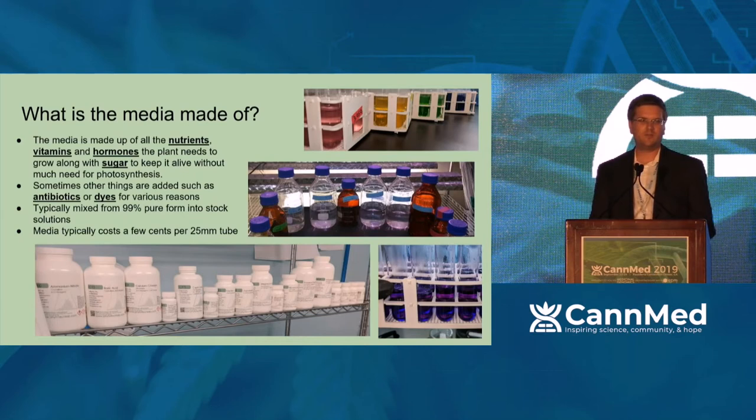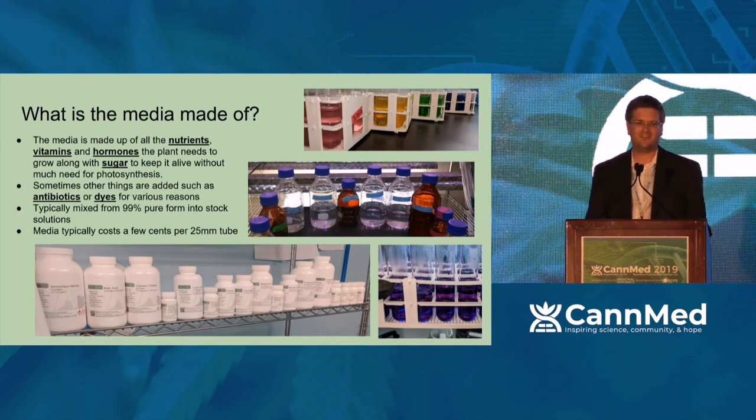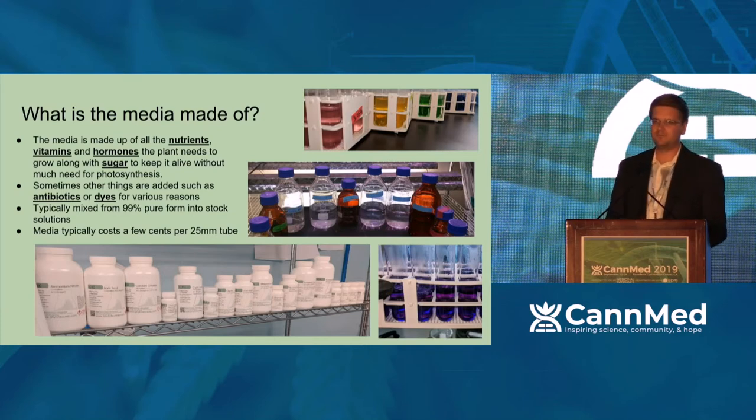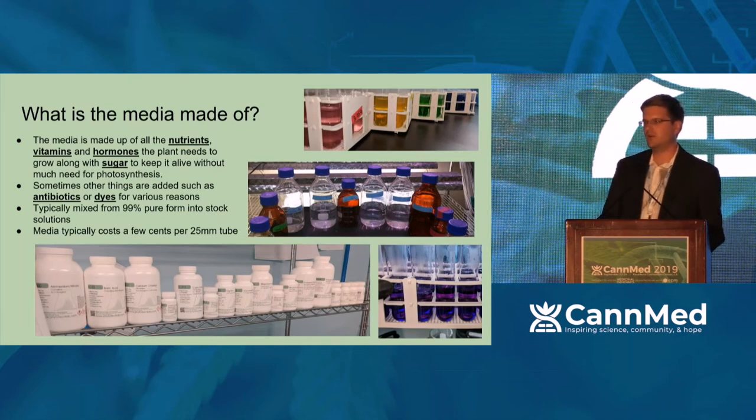One of the questions I commonly get asked doing consulting is, what's this media made out of? And really, it's just all the nutrients, vitamins, and hormones the plant needs in order to grow. Sometimes you can incorporate antibiotics to prevent pathogens from either establishing or coming out into the media, or you can add dyes to color code some of your stuff. It's all about growing with an input of sugar. Instead of letting the plant photosynthesize, the plant grows off the sugar that's located in the media, along with all the nutrients, vitamins, and hormones it would normally need to grow.